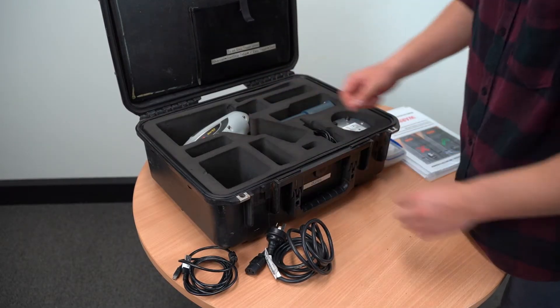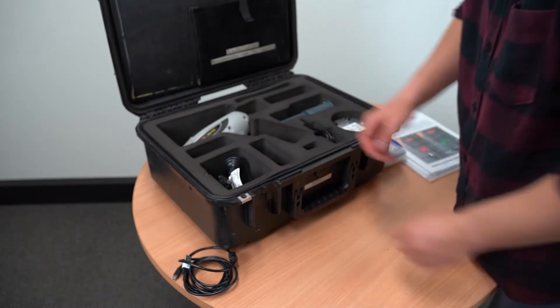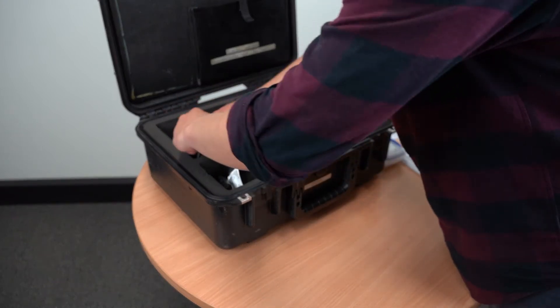Next to this is a good place to put the screwdriver and the cleaning brush. In the larger hole, place the thick charging cable wrapped up, and in the smaller hole next to it, the other cords.